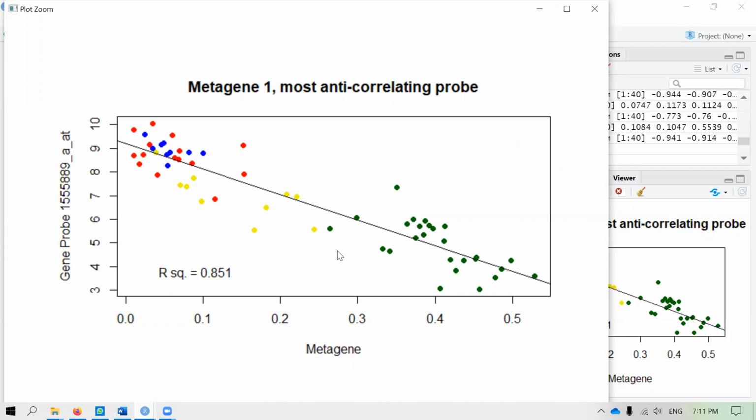It seems that one of the cancer subtypes may be neatly separated from the rest using just these 2 probes. That means we can look at the expression of these 2 probes in the microarray data, or rather the intensity of these 2 probes. So this can be quite interesting. That gives you some idea. Of course, we can then find out the identity of this gene, what gene this probe actually measures. That can give us a lot of biological understanding as well, just by looking at all this information.